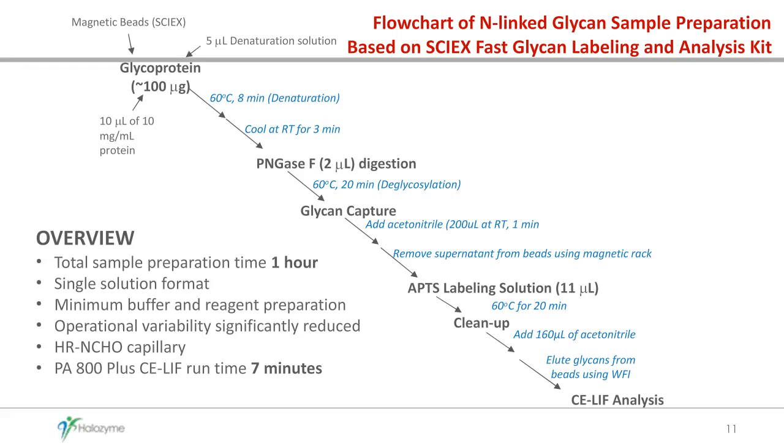In terms of the SCIEX kit, we have our glycoprotein, and I did want to mention that they use magnetic beads, which are proprietary. Everything here is in solution, so there's no spinning, no centrifugation involved. For sample handling, it makes it very, very simple.